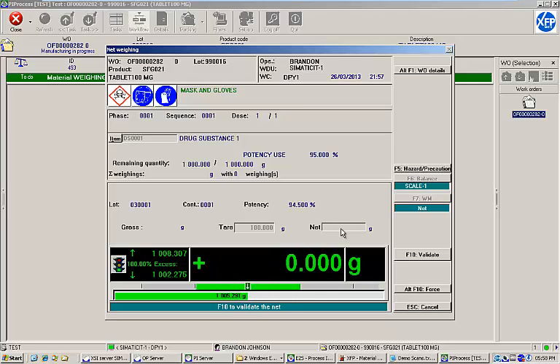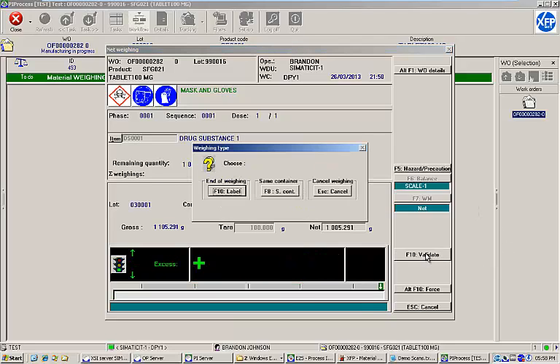With the weight range met, I will click the Validate button to confirm. Here I am prompted to either print a label, cancel the weighing operation, or continue weighing with the same container. I'll choose to print my label now and perform an electronic signature to move on to the next material.